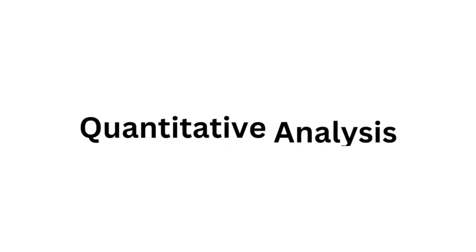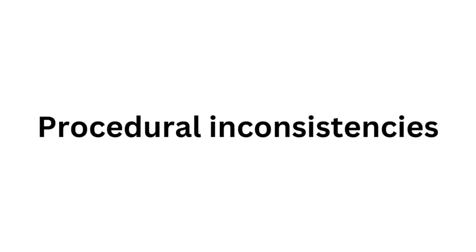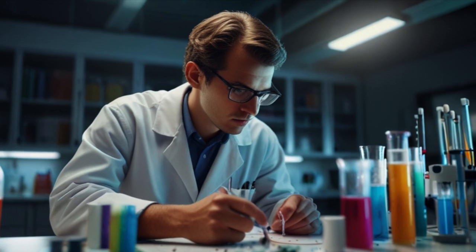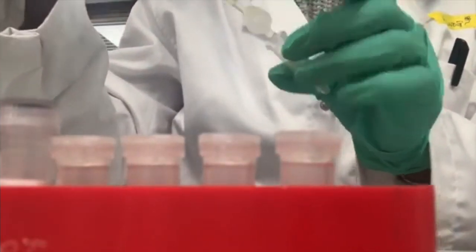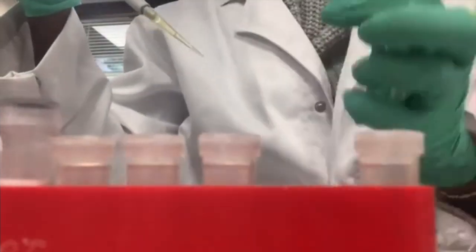Internal standards are vital in quantitative analysis. They help correct for variations in sample preparation, instrument fluctuations, and other procedural inconsistencies. Imagine you're measuring the concentration of a substance in various samples. By adding a known quantity of an internal standard to each sample, you create a reference point.